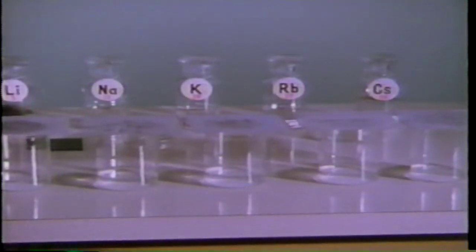Potassium reacts with such vigor that the hydrogen produced bursts into flame. Rubidium is similar. Cesium reacts almost instantaneously. Their similar properties show that we have isolated a third family of chemical elements, called the alkali metals.